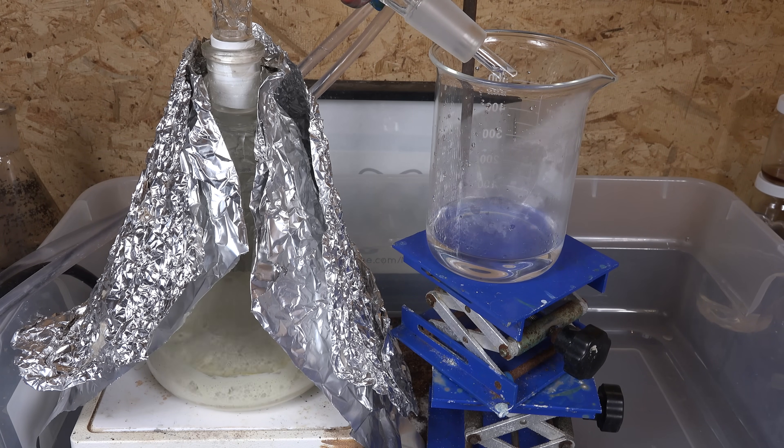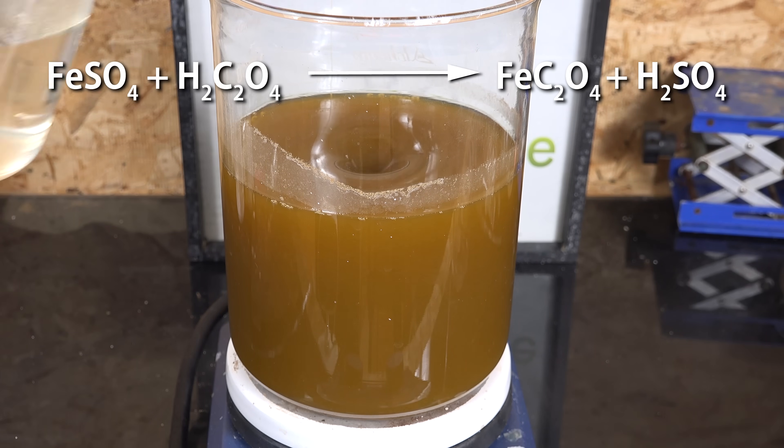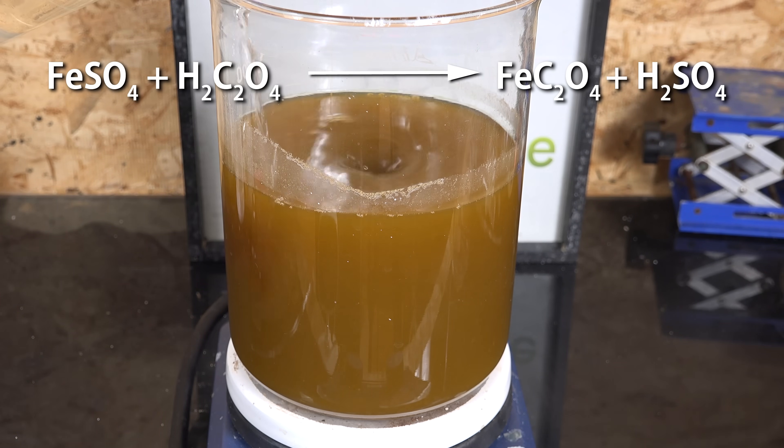The yield isn't high primarily because the reaction doesn't go to completion. As said before, reacting a strong acid with a weak acid salt tends to produce the weak acid and strong acid salt. So as sulfuric acid builds up, it reacts with the iron oxalate and converts it back to iron sulfate and oxalic acid.